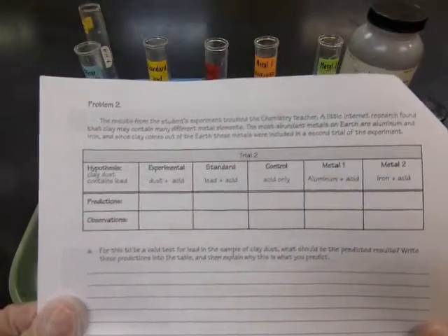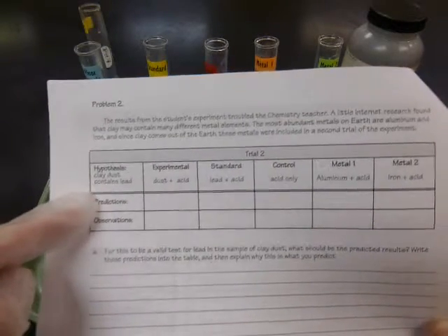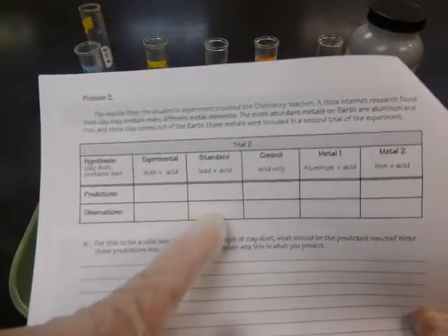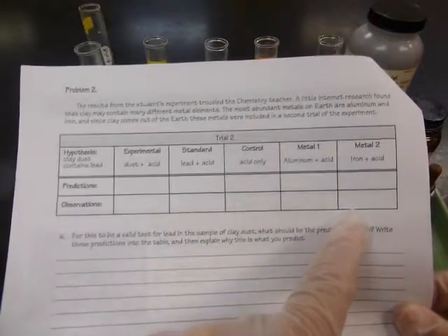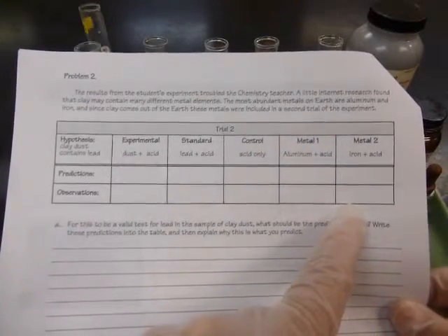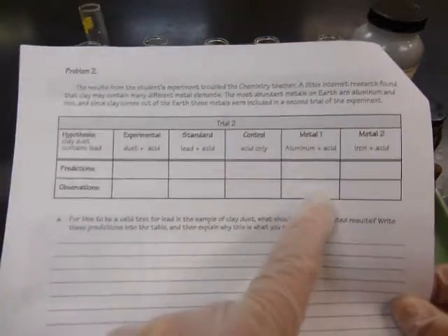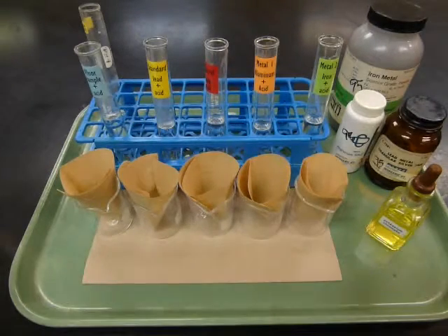of this experiment. The samples that are being tested: first, a repeat of the test for what's in the floor sample, and then a standard and a control, and two additional samples, aluminum and iron, because those are the two most abundant metals that are in earth. So stuff that comes out of the ground, high content of aluminum and iron. So let's take a look and see how the results turned out this time.